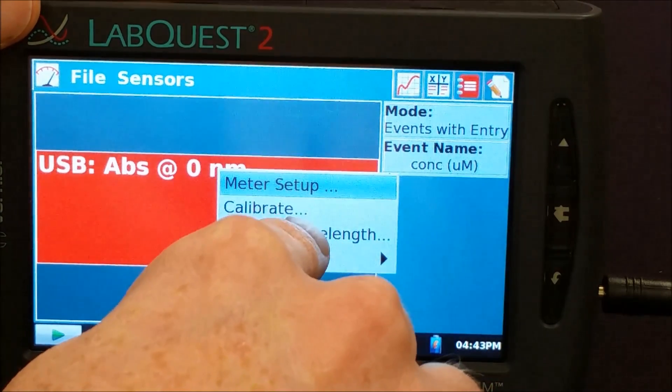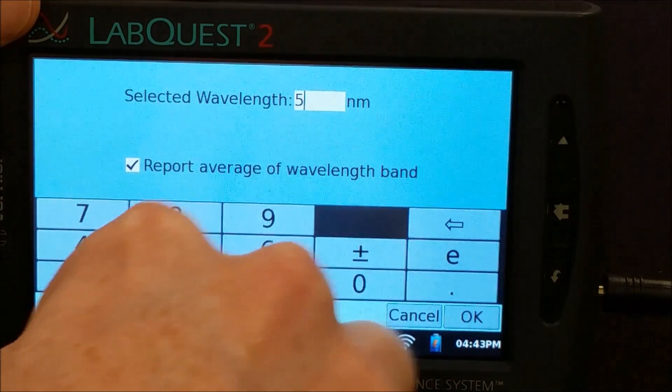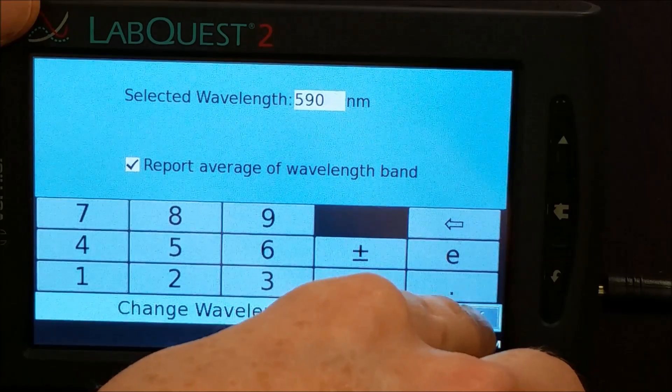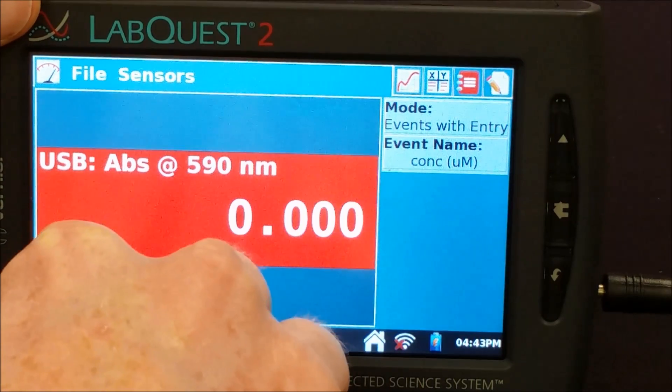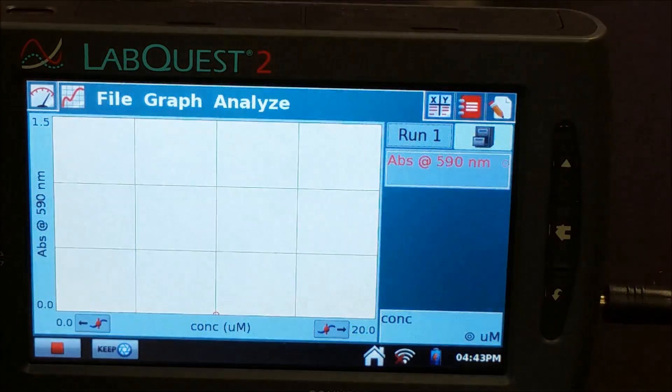And we want to change our wavelength. So I'm going to change the wavelength to 590. And if you don't know what the wavelength is, you can always plug in under Full Spectrum and see what the peak wavelength is. So we're going to go ahead and play now. Take out our blank.